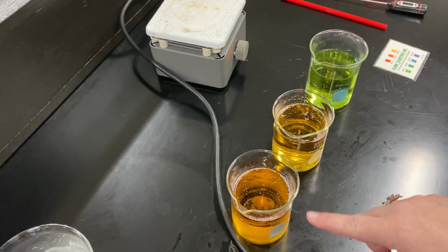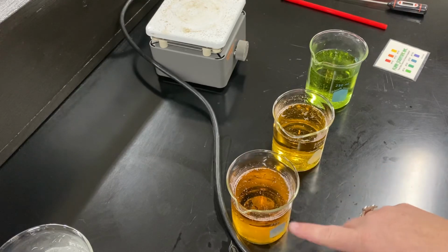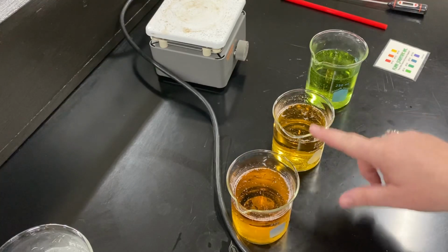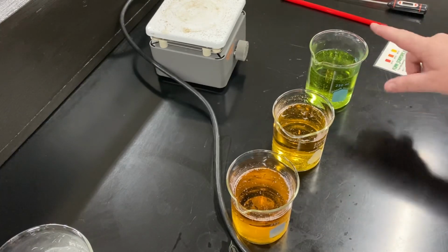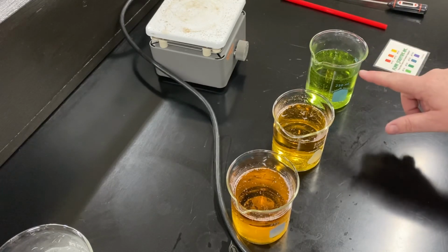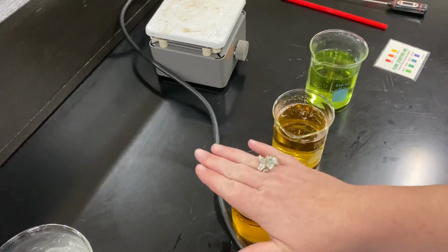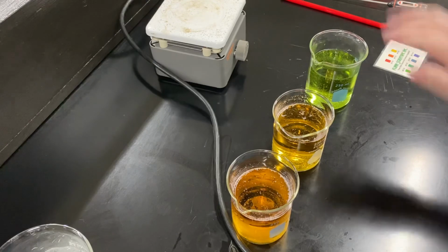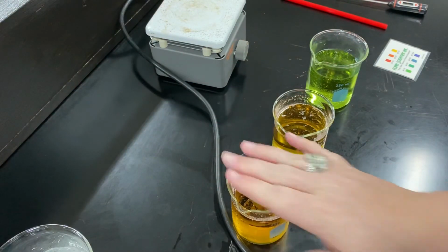So this one has more carbon dioxide dissolved in it. Then this one has the next most carbon dioxide dissolved in it. And then this has the least amount of carbon dioxide dissolved in it because it has the highest pH. So most gas, least gas, but most solid, least solid.